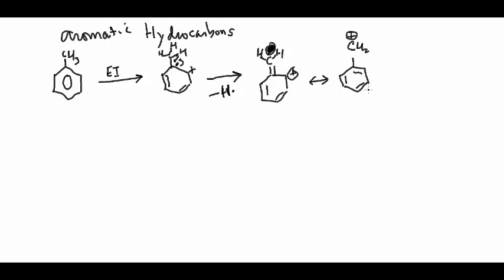Now this is, as I mentioned before, subject to a further rearrangement. Basically it's a 1,2 carbon shift where this carbon-carbon bond breaks off and reattaches.